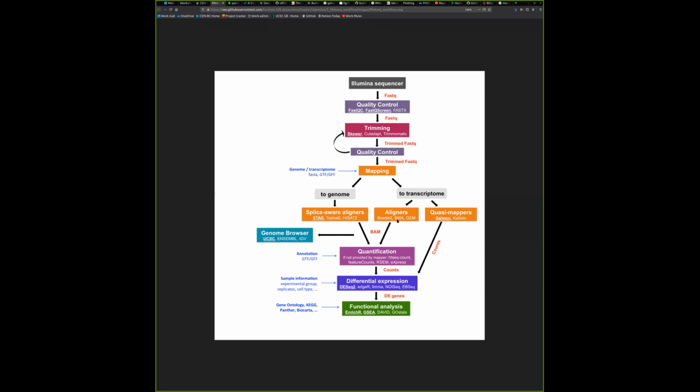So typically you would not immediately get expression data, you will not get a count matrix from this. You will get some sort of aligned read data that you can import into certain programs such as IGV to visualize your reads, or upload it to UCSC to see where the reads map to. So this is more for visualization rather than quantification.